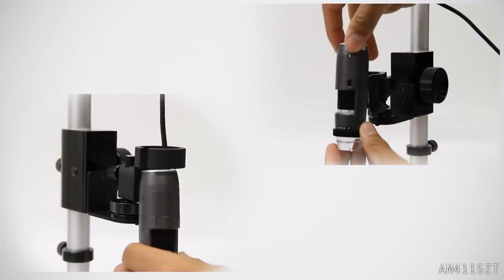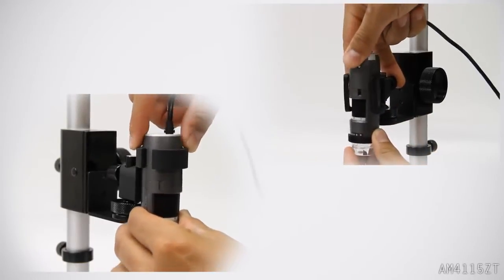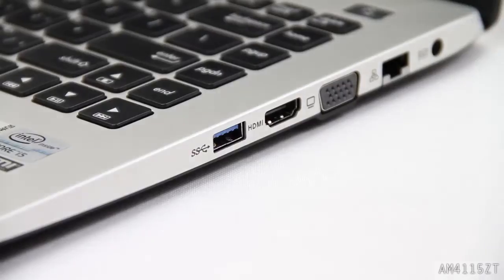To use the AM4115ZT, place it into the holster. Once you install Dynocatcher 2.0, connect it via USB port.